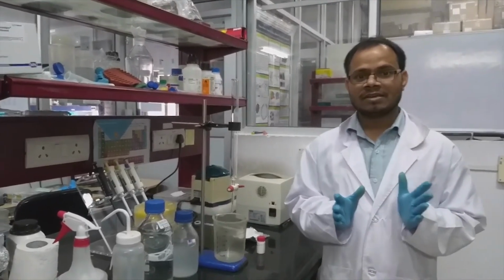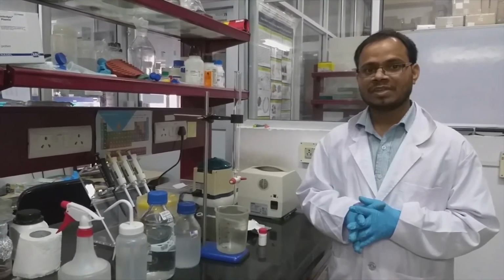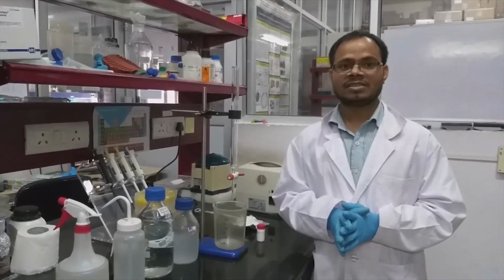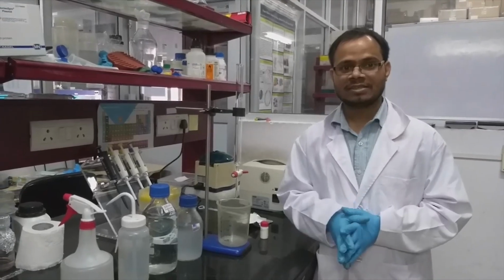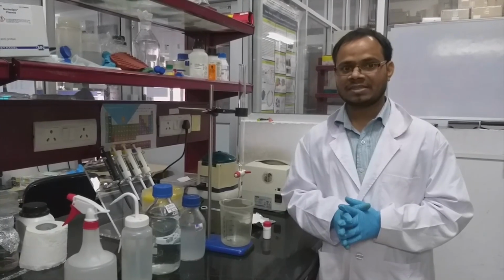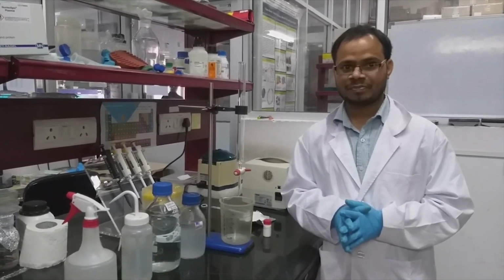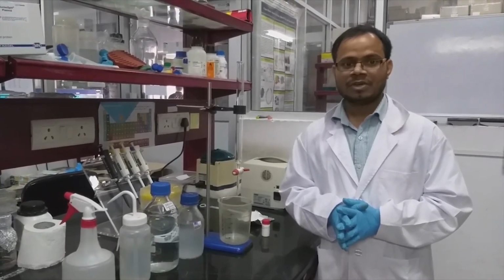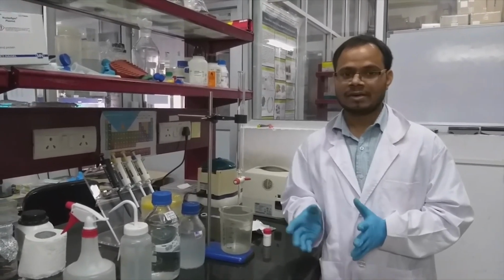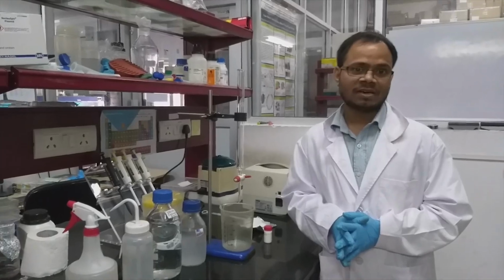What is gel filtration chromatography? There are two phases in this process. One is the stationary phase, another is the mobile phase. The stationary phase is mainly a cross-linked matrix. For example, we can use dextran, another name of which is Sephadex.